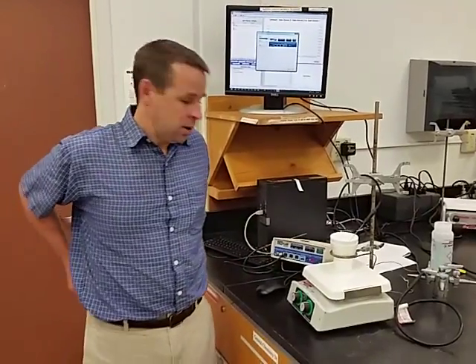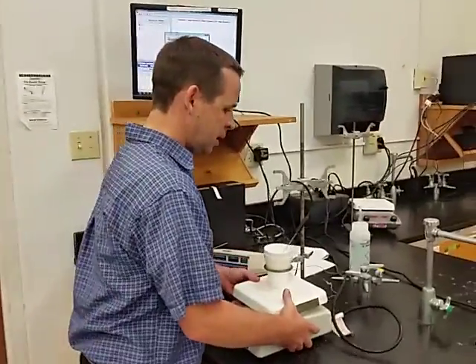Setting up my Chem 106 Lab 1. First lab in Chem 106, the hot packs, cold packs lab, okay? So this is the setup here.